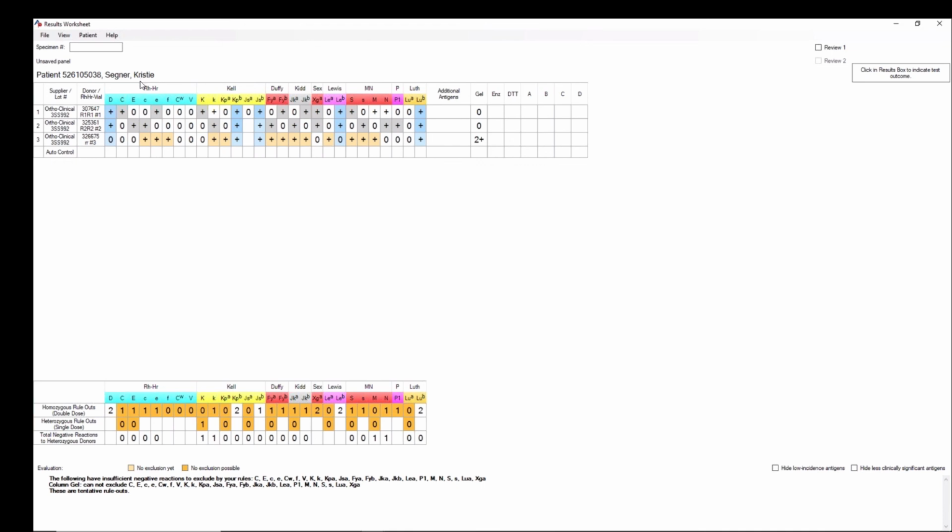And the specimen number, is that intended to be a number identifier that's a static number? No. Yeah, we put the specimen number in there when we started working with the analyzers because they are all controlled by specimen numbers, and we also understand that some people are sticklers about using specimen numbers for all their samples. So we allow you to put in a specimen number. If you put it in during your work, you must enter it every time you bring up that work on that patient before you save it. It's got to have the specimen number. If you enter it back in the options where we were, then you have to have it every time. We don't recommend that, but some people want to have the specimen number each time.